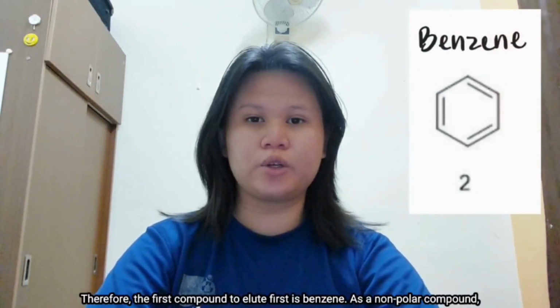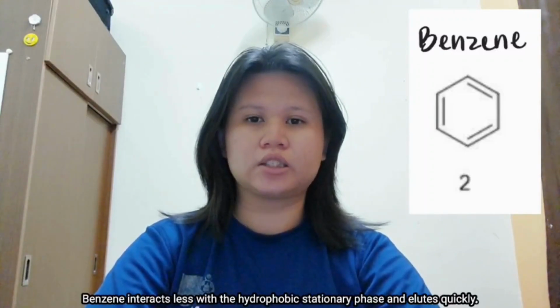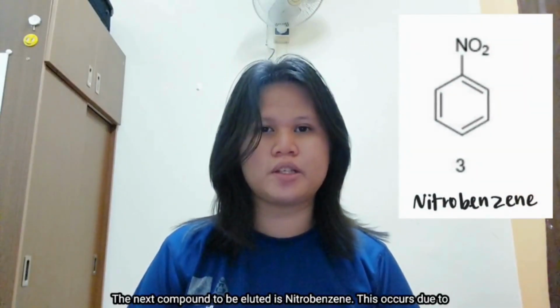Therefore, the first compound to elute is benzene. As a nonpolar compound, benzene interacts less with the hydrophobic stationary phase and elutes quickly. The next compound to be eluted is nitrobenzene.